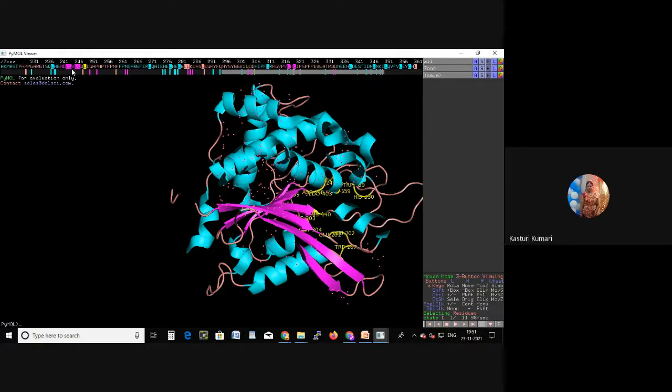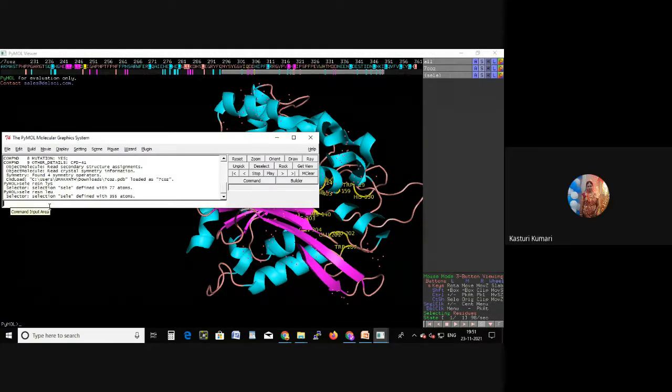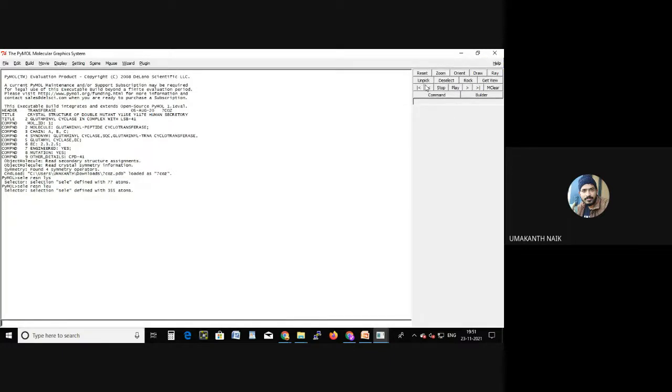Yes, sir. I have selected the residue called L. Sir, what you have selected now has been done in the Wattpad, no? Not in water. I have done it in the dialog box. Sorry, this did not come clear. Can you just maximize where you have opened this? Ma'am, when you open the file itself, the software itself, you can open this particular dialog box. Okay. Sir, can you maximize it? I'll just show you later.